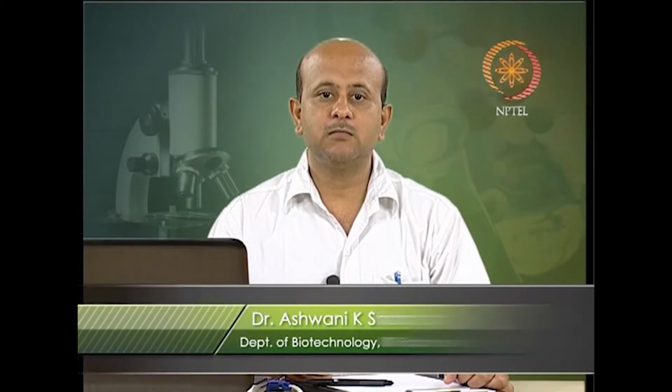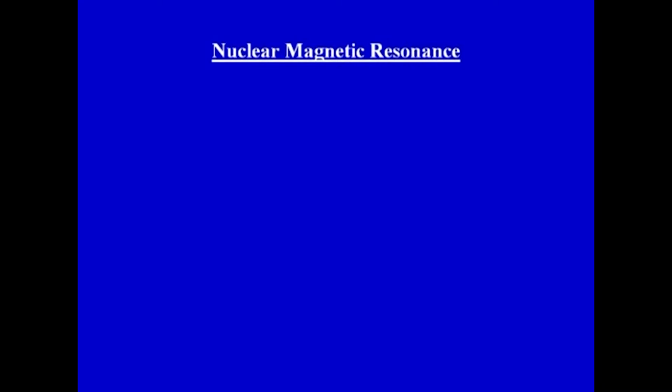In this lecture, we are going to discuss two of the most important and powerful techniques for determining the three-dimensional structure of molecules, maybe large or small, organic molecules or macromolecules. These techniques are nuclear magnetic resonance spectroscopy and X-ray crystallography methods.